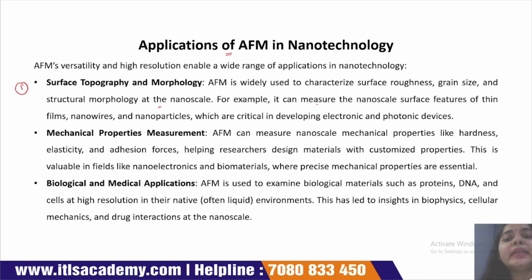For example, it can measure the nanoscale surface features of thin films, nanowires, and nanoparticles, which is critical in developing electronics and photonic devices. This AFM is widely used for the characterization of samples.